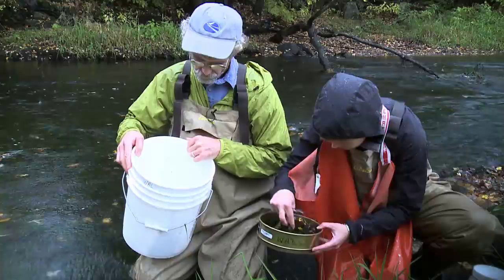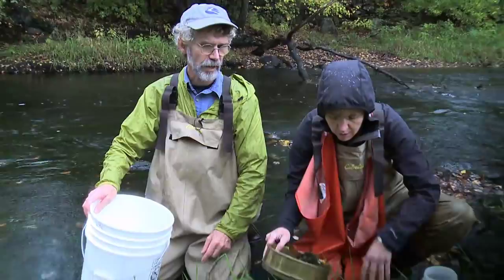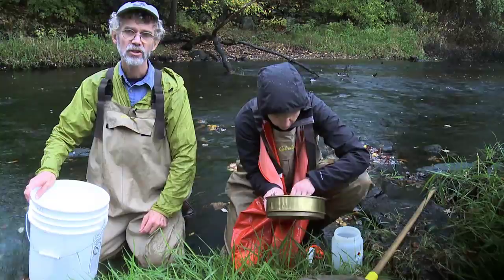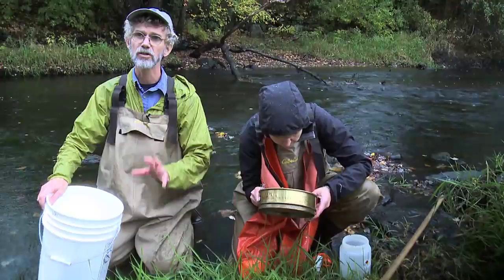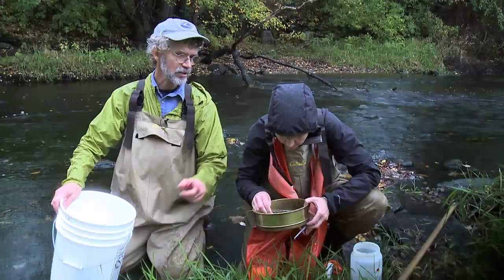Then I inspect the sample to make sure we've got all the insects removed. Once we're satisfied, we'll take this sample and put it into our labeled sample jar. Kim has already pre-labeled this jar — it's 70% ethanol that we preserve the insects in. You do four samples and put all of them combined into one jar, and that would be your sample for this site. In case there are any insects stuck to the screen, we'll use a pair of forceps to pick them out and make sure they're put in the sample.